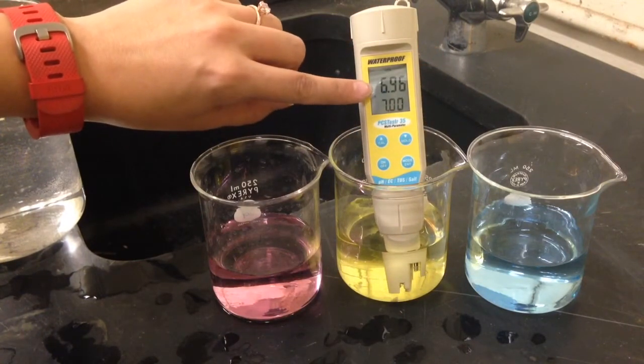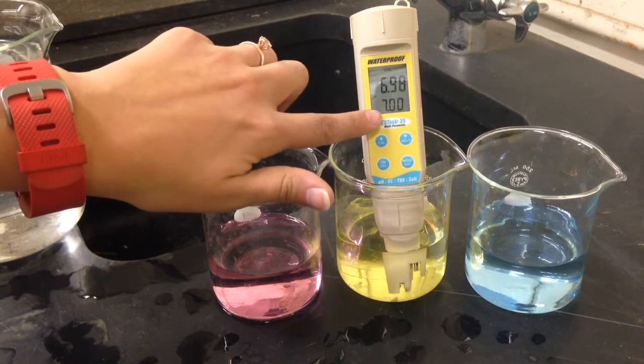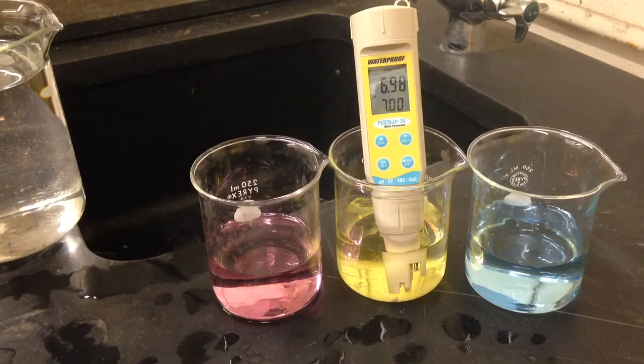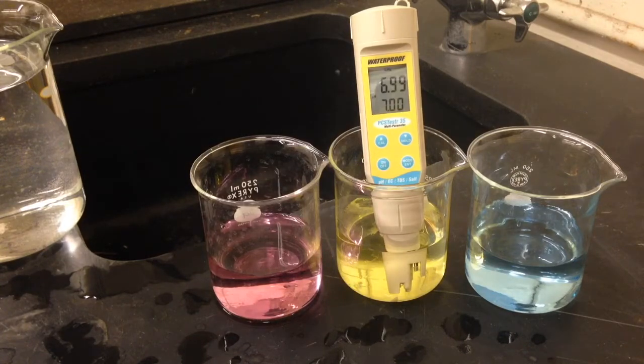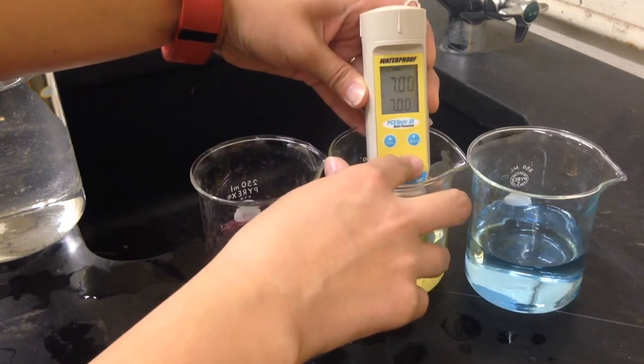The primary display reads the actual pH value of the container, and the secondary display will show the closest pH standard. When the meter is immersed, we must wait for the primary display to stabilize. Once the primary display has stabilized, we will push the mode enter button.